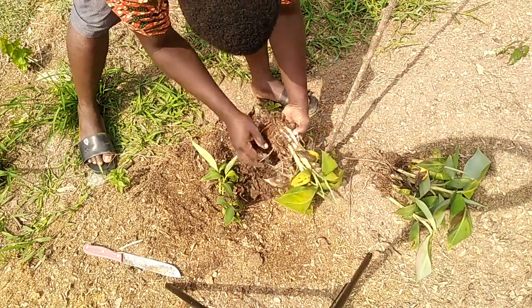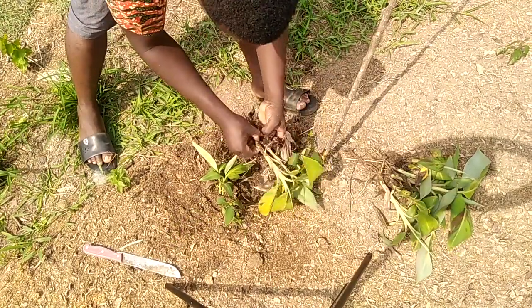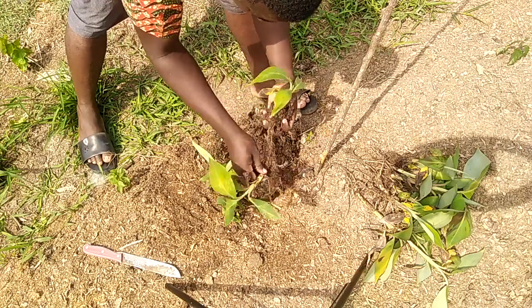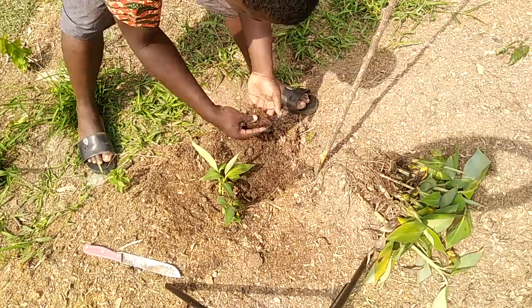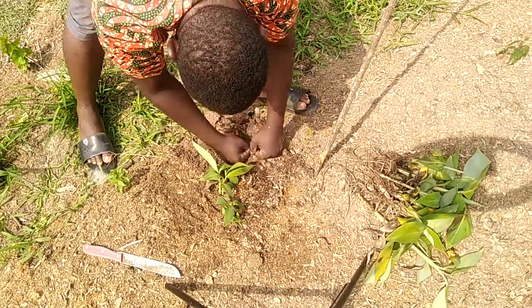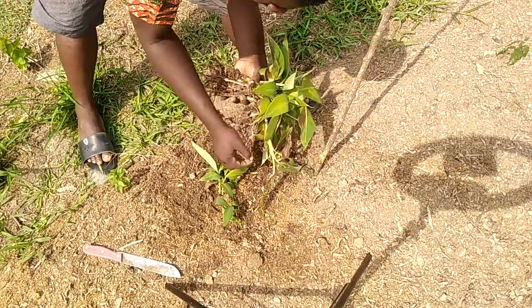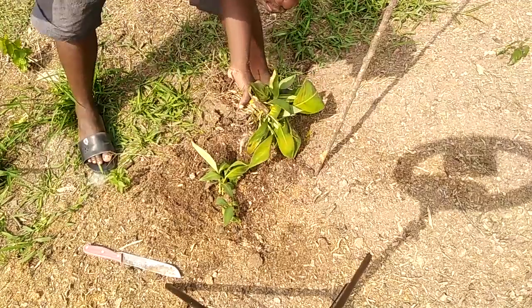This one also gave us one, two, three, four, five, six. And still, you can still put this one back for another group. So you can see: this gave us seven, this gave us seven — making fourteen. This one gave us six, making twenty. And the other part gave us two, making twenty-two.